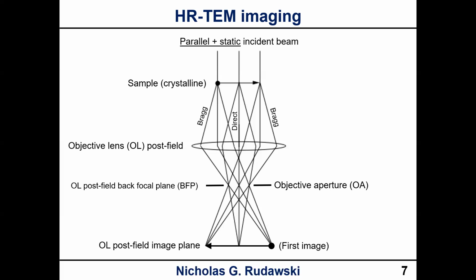I have an entire video talking about this, but it is not correct to call those electrons that leave traveling the same direction as they came in unscattered. Obviously, with the Bragg diffracted, the direction has changed, so there's no way that it wasn't scattered. But in the case of direct as well, that does not necessarily mean that there wasn't scattering either.